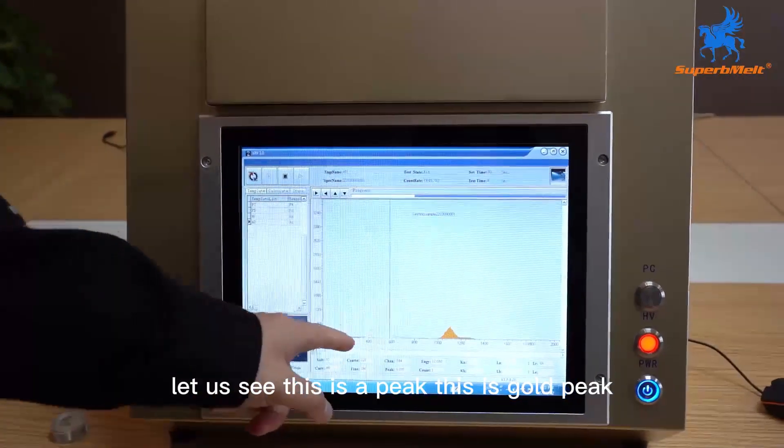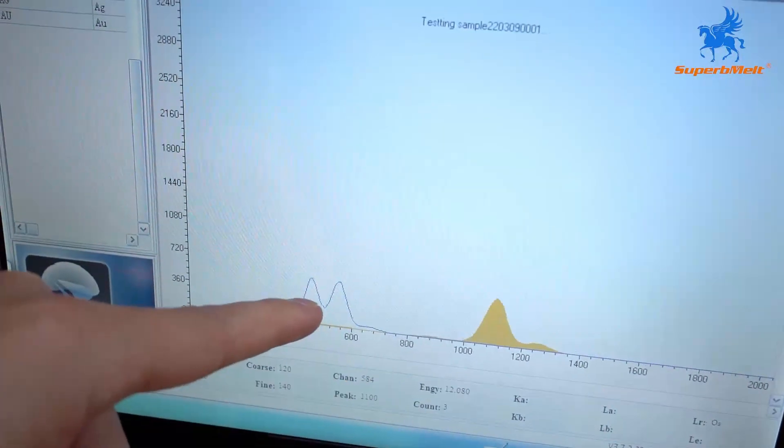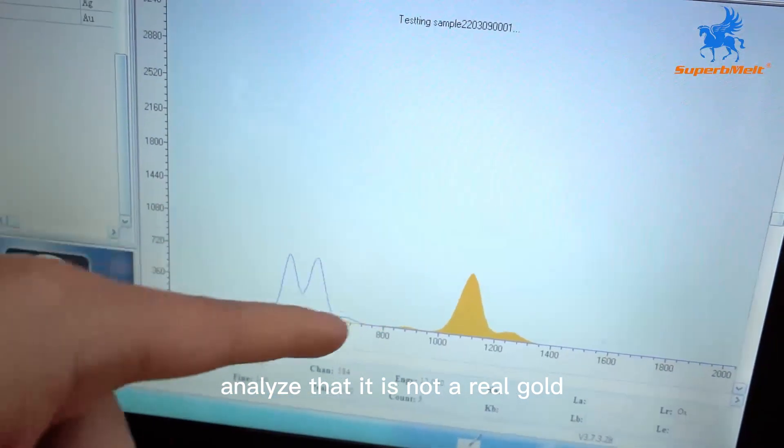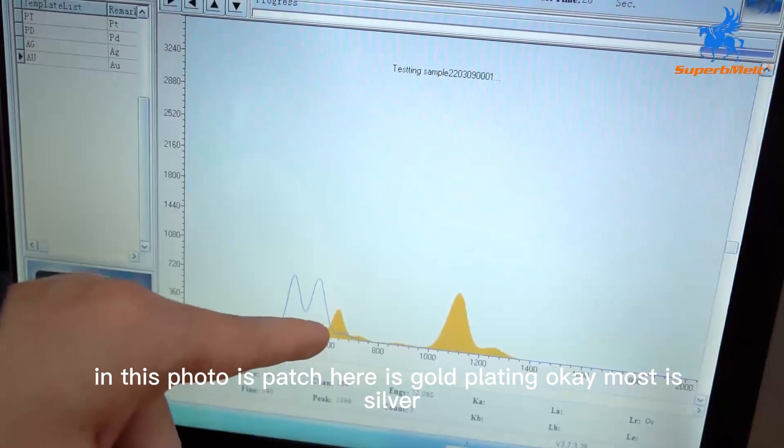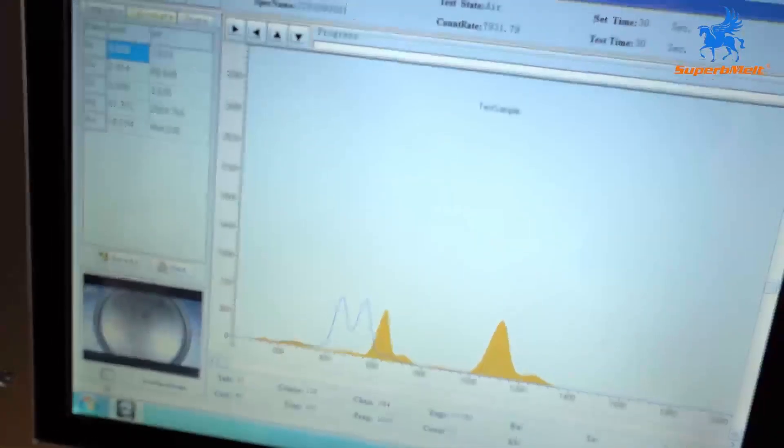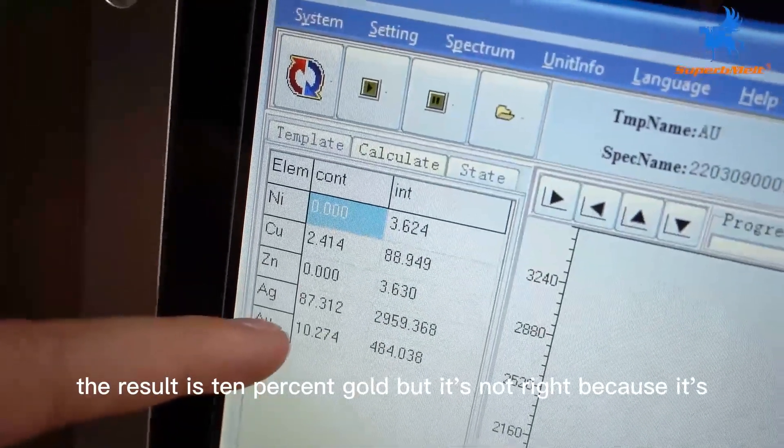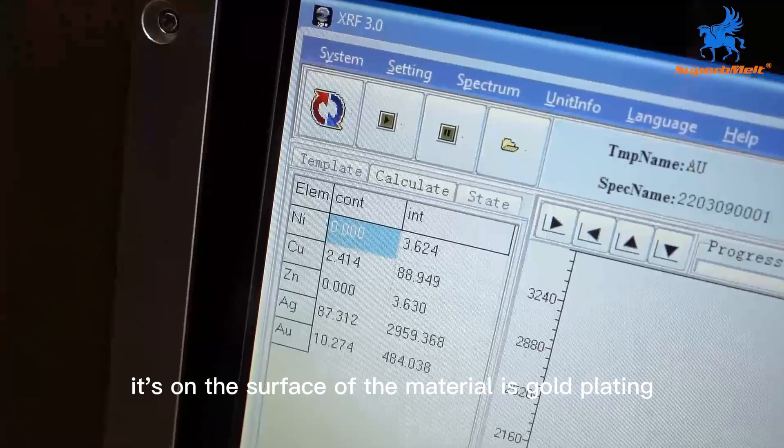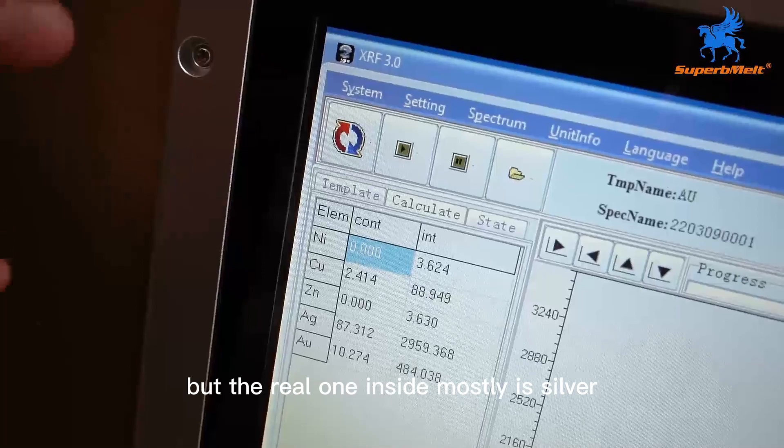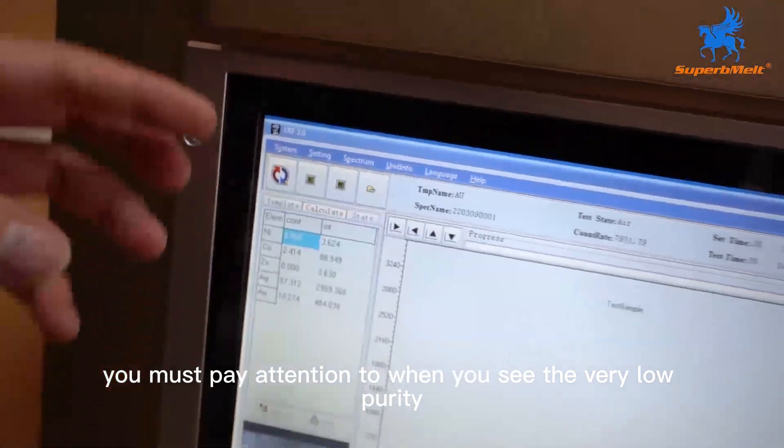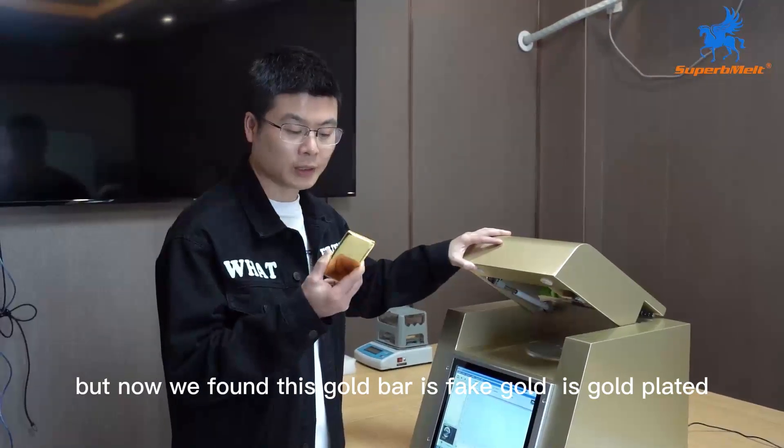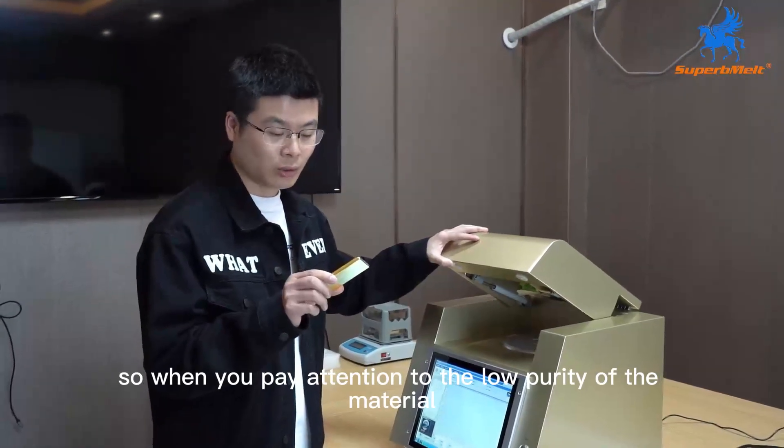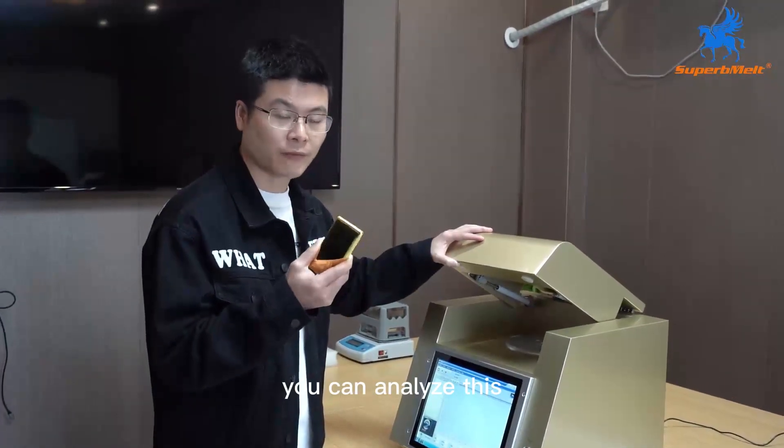Let us see the peak. This is the golden peak. The whole material is not in the golden peak. We can analyze that it is not real gold. In this part, gold here is gold plating. Most is silver. The result is 10% gold, but it's not right because on the surface of the material is gold plating. So it shows temperature is a little high, but the real one inside mostly is silver. So this one is fake gold. You must pay attention when you see the very low purity of your material.